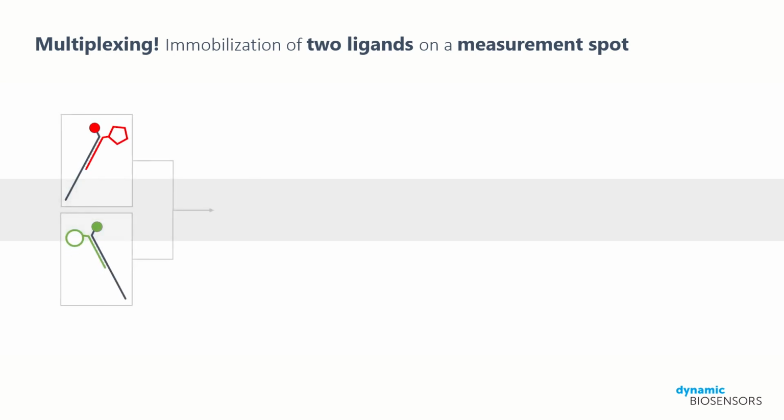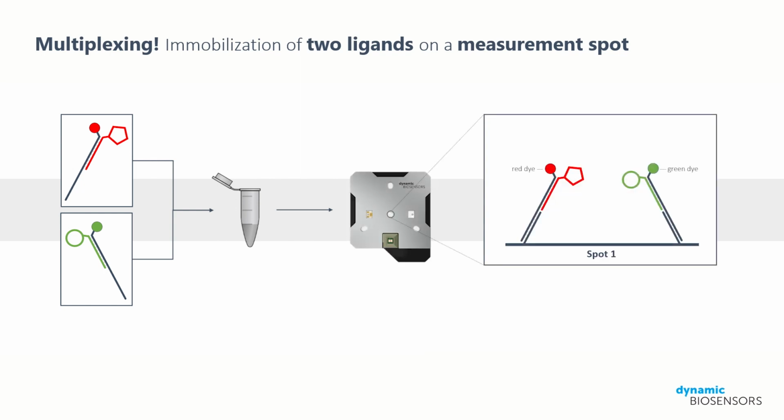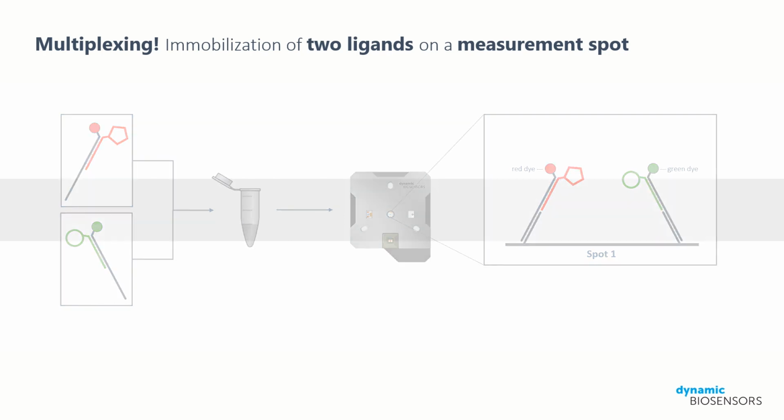These ligand strands are then mixed in one sample vial. Since the anchor DNA at each electrode on the heliX adapter biochip is the same for both colors, the ratio will be transferred to the desired electrode when your ligand solution is hybridizing. Due to the color code, the multi-channel optics of the heliX will record the interaction taking place with each ligand individually.